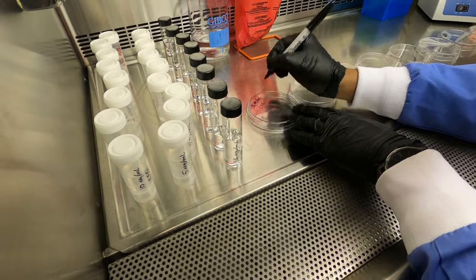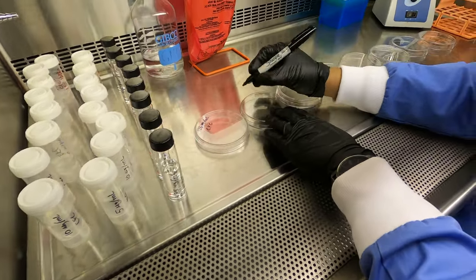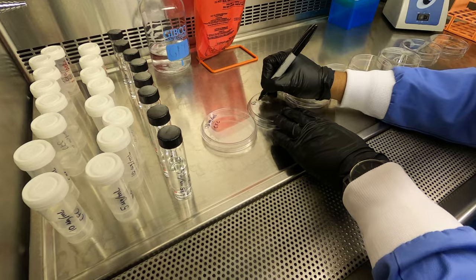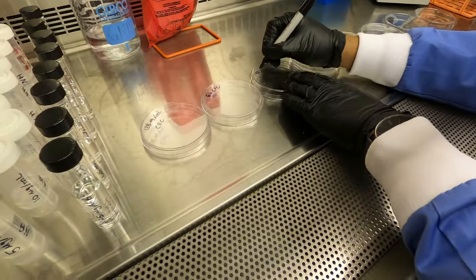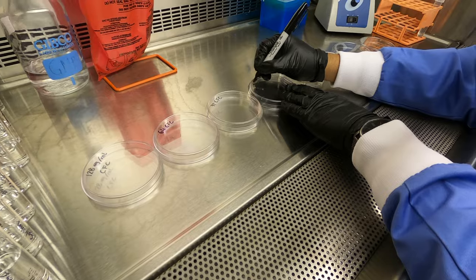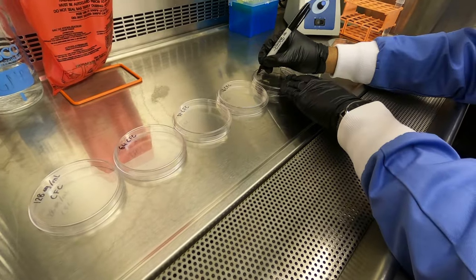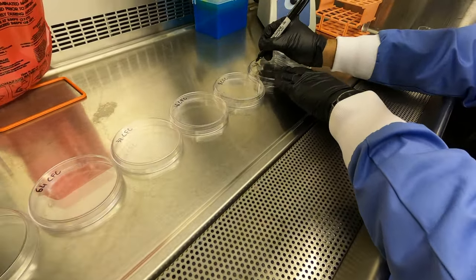The first step whenever preparing agar is to label your plates, and I recommend doing this on the bottom agar side. That way if the lids get lost, you'll always know what drug and what concentration of that drug is present in each one.